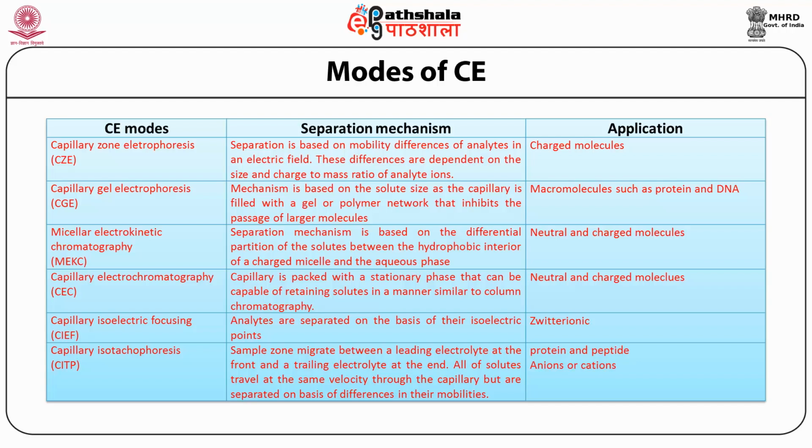Let us talk about the second one, which is known as capillary gel electrophoresis, CGE. The separation mechanism for CGE is based on solute size, as the capillary is filled with a gel or polymer network that inhibits the passage of larger molecules. This can be used for separation of macromolecules such as proteins and DNA.